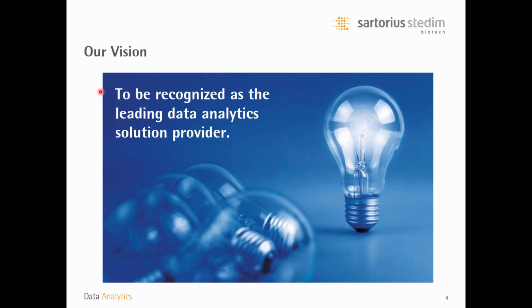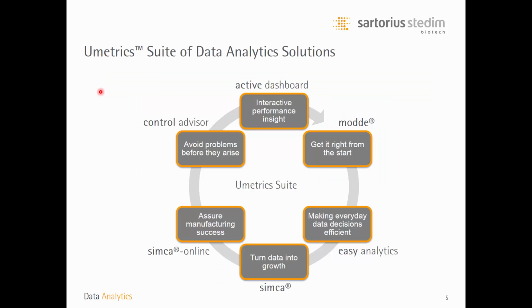data analytics solution provider. We are a business solution provider within the fields of advanced data analytics, and our solutions are realized through the so-called Umetrics Suite. The Umetrics Suite has a number of software elements inside it. We have, first of all, the MODDE software for design of experiments to get all data right from the start. We have the easy analytics solution to enable everyday data-driven decisions in an efficient manner. Then we have the flagship SIMCA for multivariate data analysis, and this is also where today's presentation will take place.